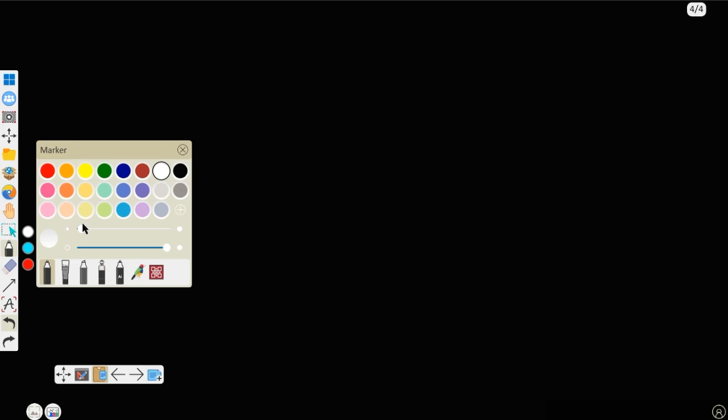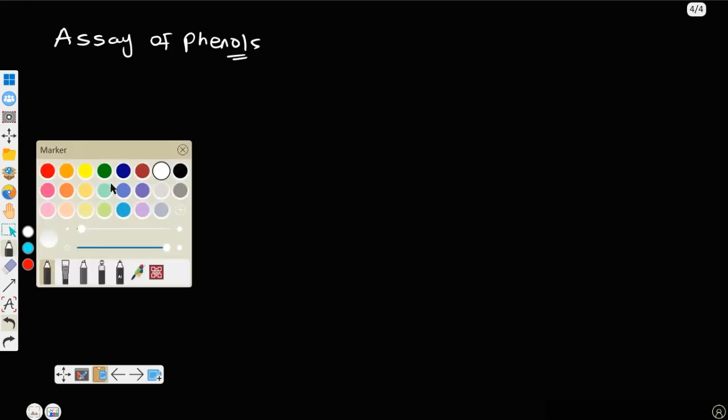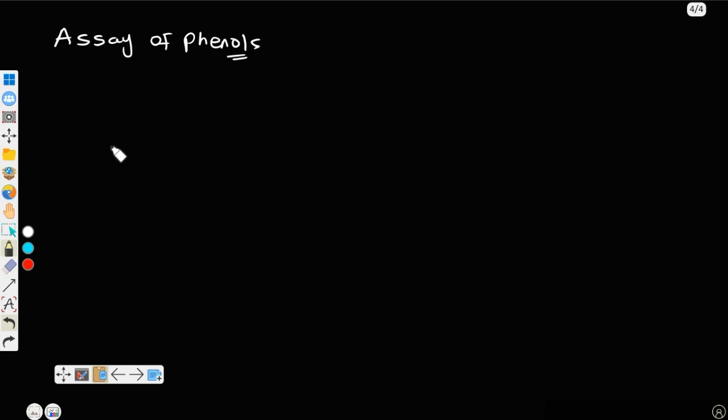Is that okay? So have it as assay of phenols. Is that okay? Now, at the end of the day, what are we actually talking about? What is used for the assay of phenol? Now, what is used is bromine.